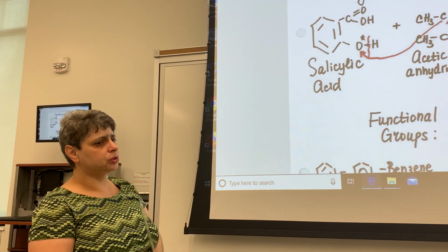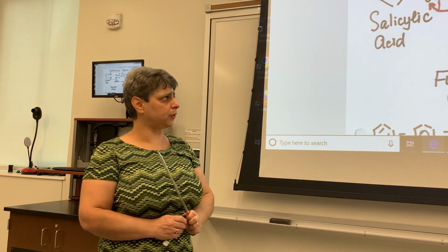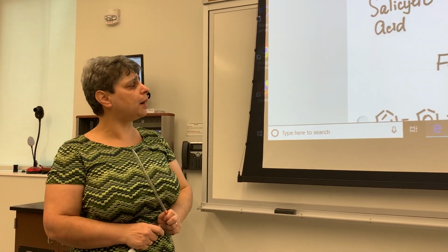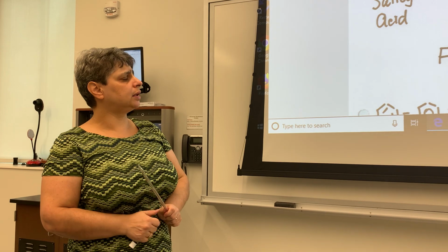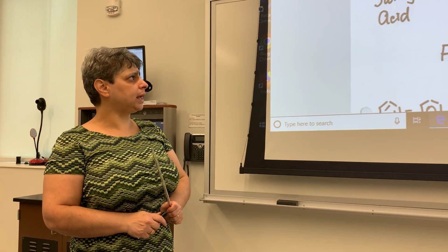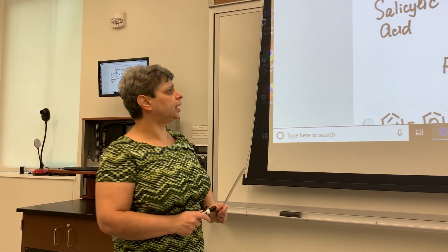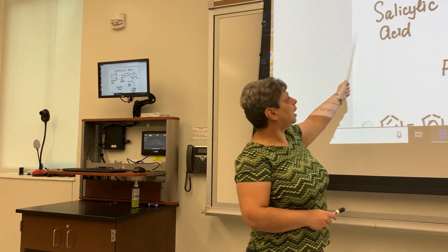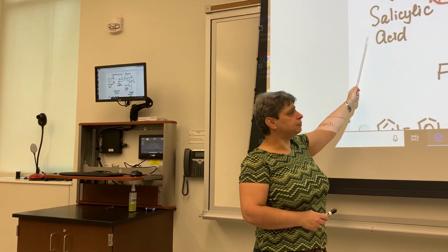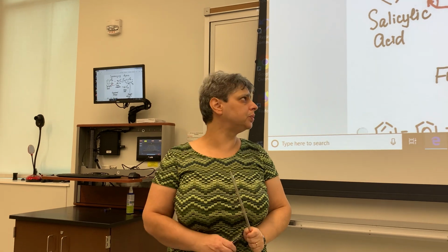The procedure used for purification, discussed in the handout that hopefully you have printed and will have available for lab, discusses the fact that recrystallization is a method employed by chemists that's based on different solubilities of the desired product and undesired impurity, like in our case salicylic acid is the undesired impurity.